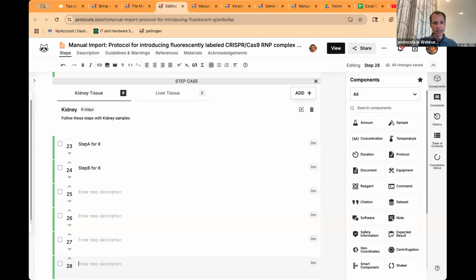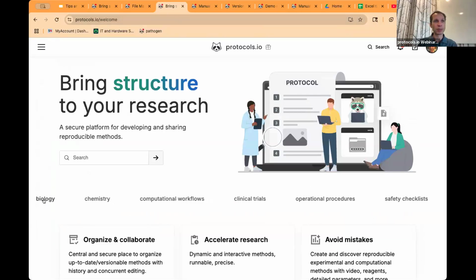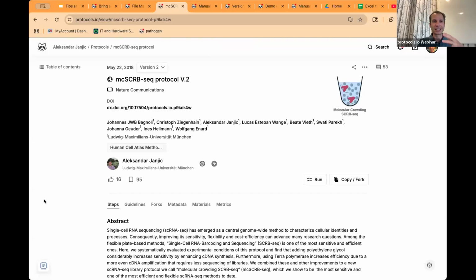All right. And then question about a collection. Once a collection is created, will it be automatically updated if a researcher modifies one of its protocols? So if you modify a protocol, when people land on it, we do tell you that there is a new version of it available, but the collection is a snapshot for reproducibility and preservation of what was done and, for example, published 2 years ago.